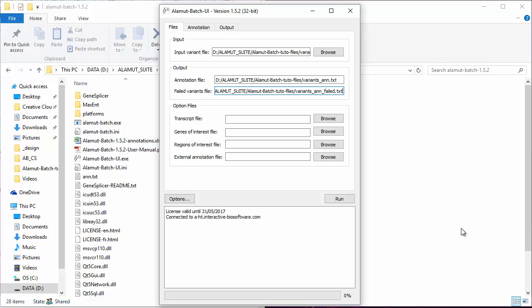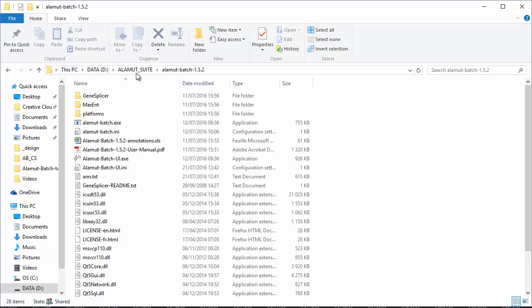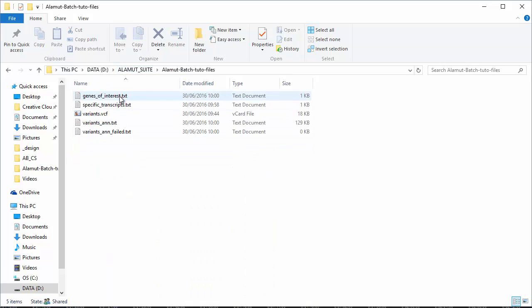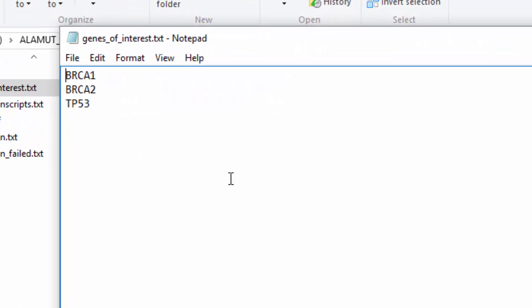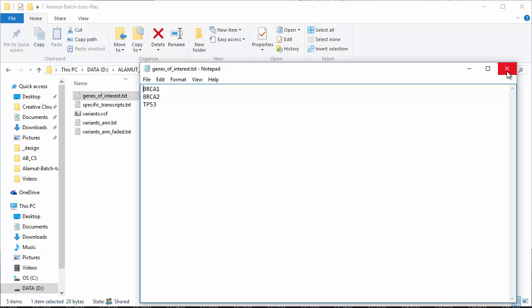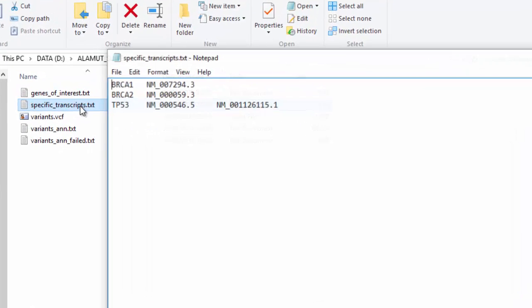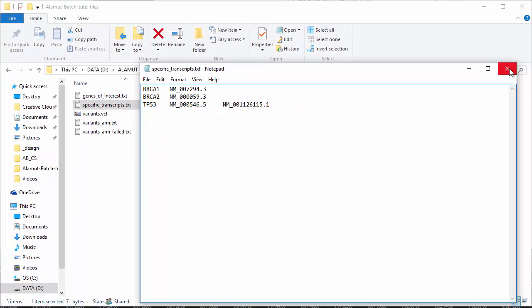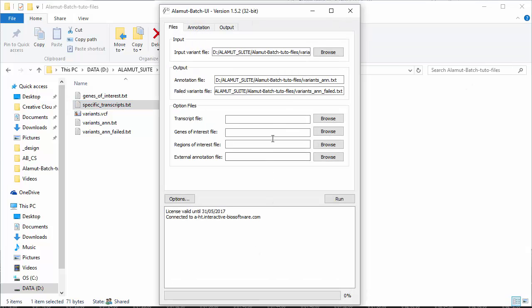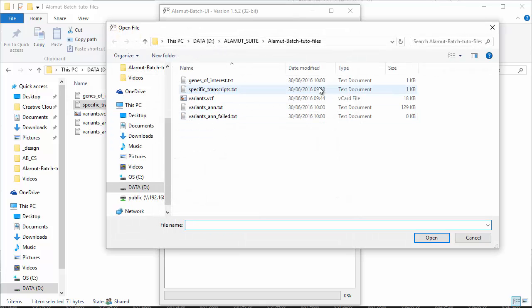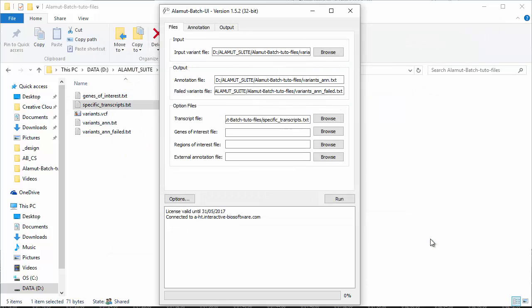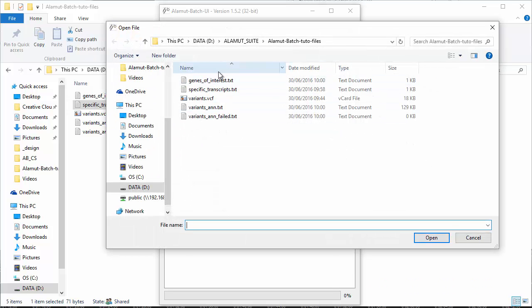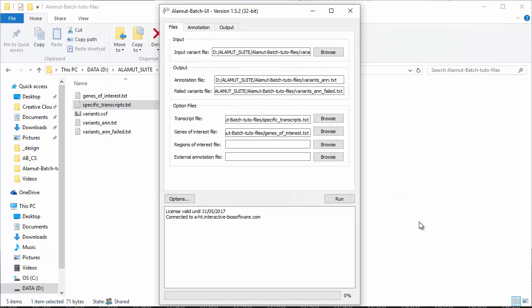In case you want to restrict annotation to specific variants, Alamut Batch allows you to input additional files such as a list of genes, transcripts, or regions of interest. For example, let's work on specific transcripts of three genes: BRCA1, BRCA2 and TP53. We need to create text files as follows and upload them into Alamut Batch. Alamut Batch also allows you to integrate external annotations in the annotation output file. More details about these files are available in the user manual.